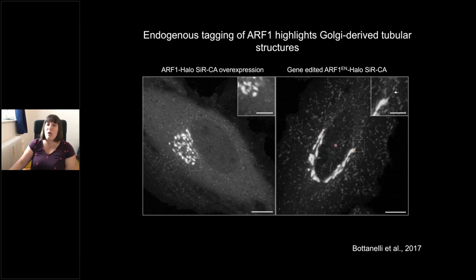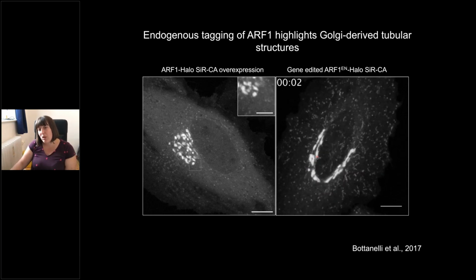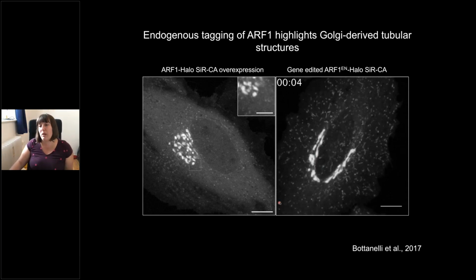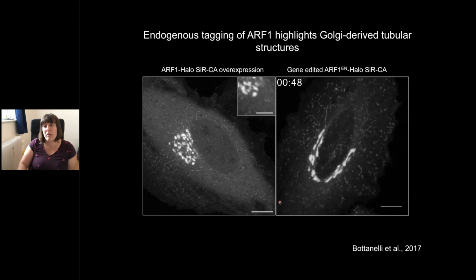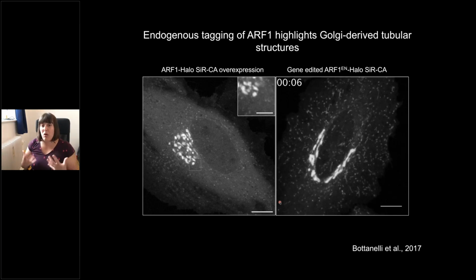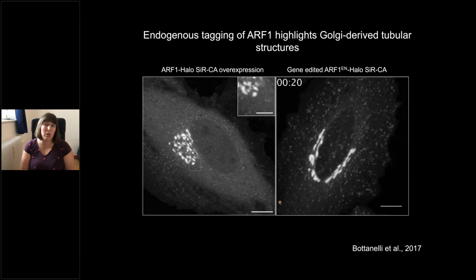It's the nucleus, and that's why we call it the perinuclear area, because I realized that I say that a lot. And these structures are very dynamic. For example, you have a tubule down here that is coming out of the Golgi, and now we know that it attaches to microtubules and moves to the cell periphery. So that was very exciting for us. This is a not very well characterized role of this small GTPase.